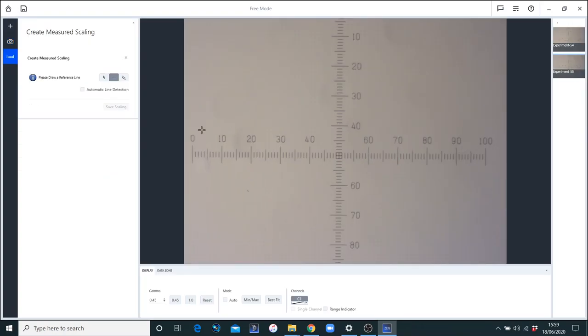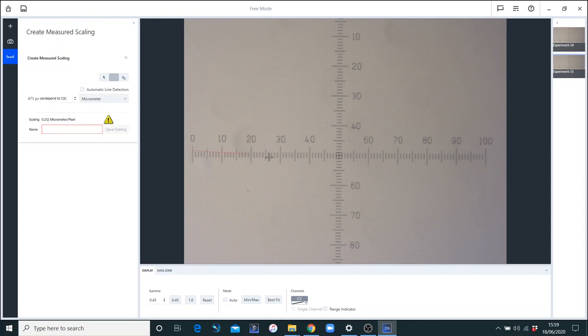Now, as we come into this immediately, it says please draw a reference line. So I'm going to draw a line on the scale on the captured image, and I'm going to make that as big as I can for reasons of accuracy. Obviously, there's a vertical scale as well, but we're not going to be using that since we're only scaling in the x direction because we're dealing here with square pixels. We don't need to worry about the y direction at this point.